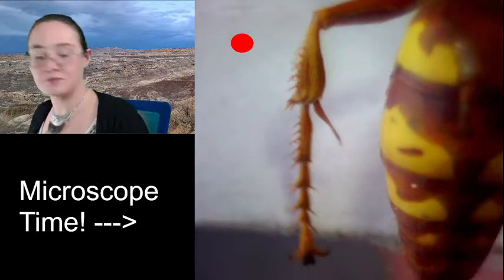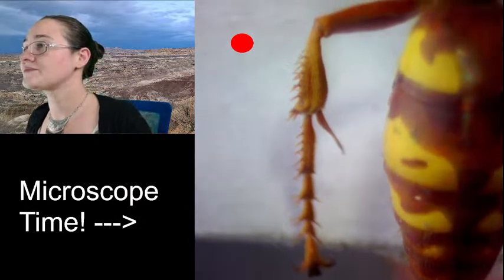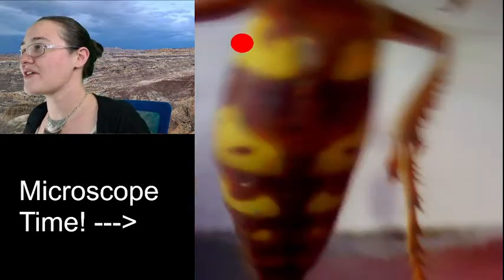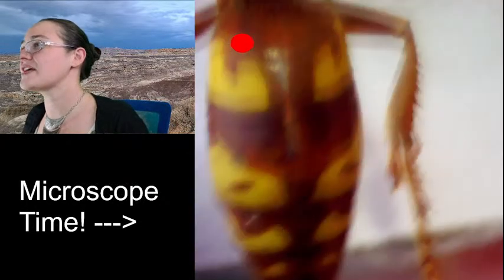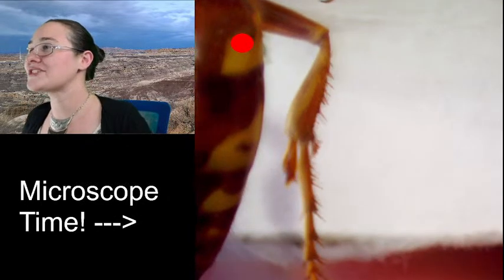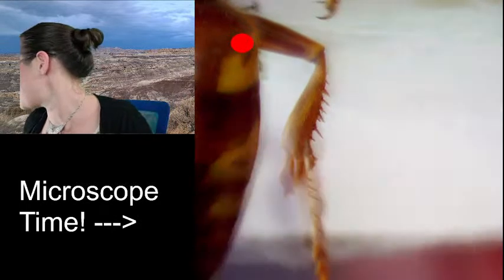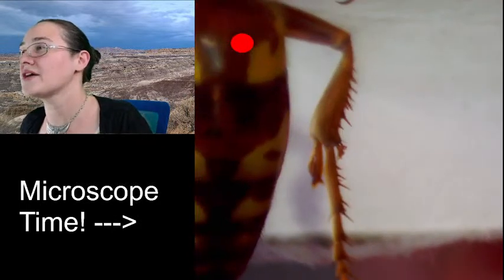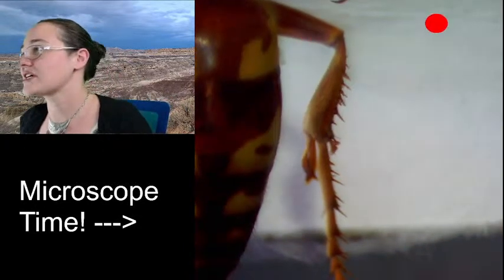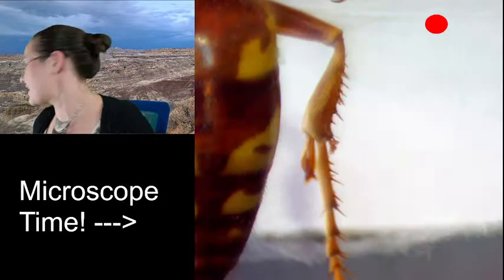All right. So trying to decide if I was going to sketch the left or the right side, but I think I'm going to show the right side because that's the side I'm going to be sketching. Although I don't like the tibial spur on this side as much as I liked it on the other side. I don't know what this one is doing. Like, why is it so much wider? It almost looks like it's two individual pieces, which is interesting. Maybe it's too... I want it to brighten up, but it's not going to get brighter.